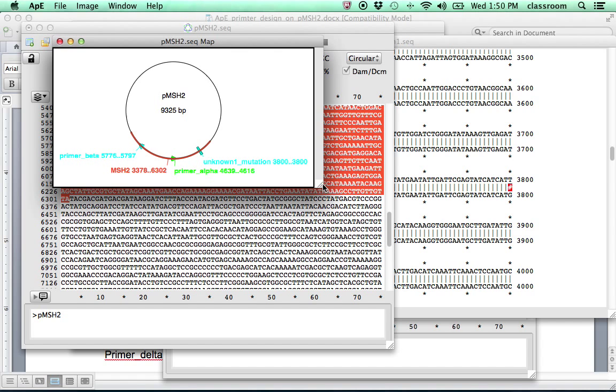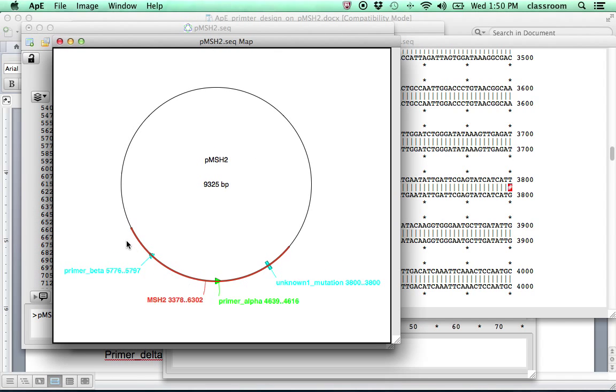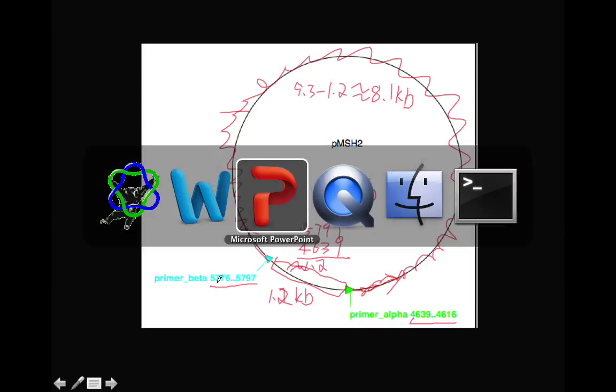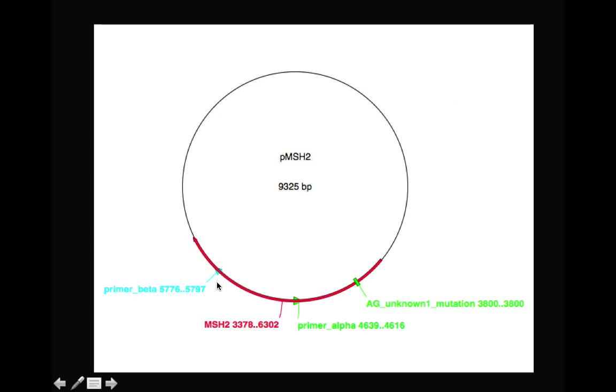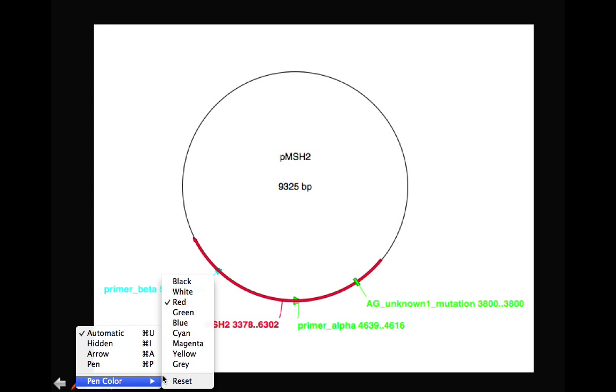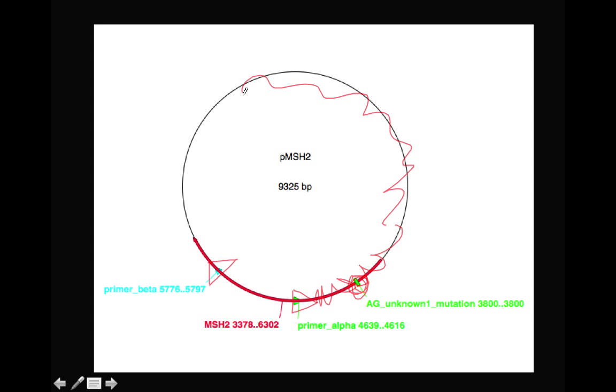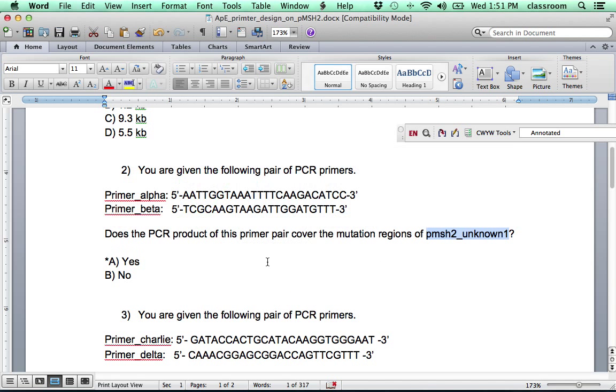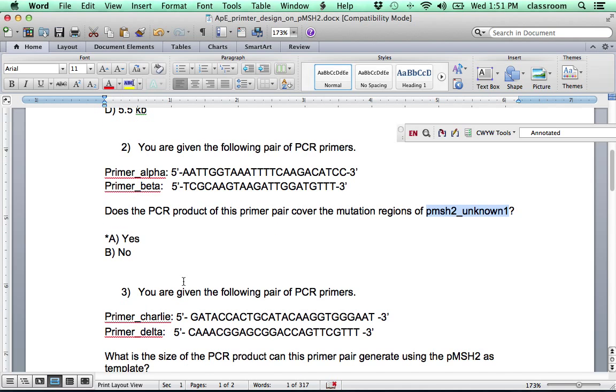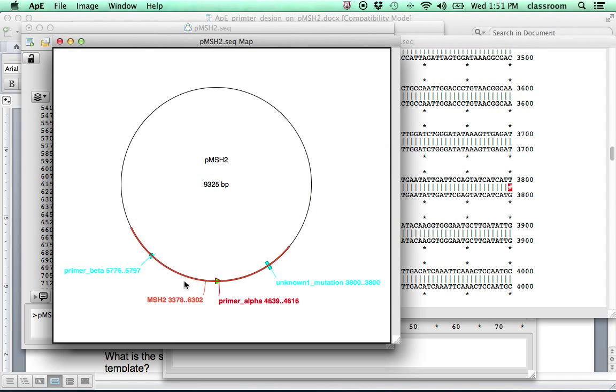OK. And then look at the graph. OK. Now, this is the graph we have. So the red is the MSH2 coding sequence. That's the mutation it has. And those are the primers. And basically, this is what the graph is. So we have the mutation here. And the primers alpha, primers beta. And the product is this region. So the mutation here will be covered by this PCR product. So that's for the second question. And the rest of the questions are similar to this. You can figure it out on your own.